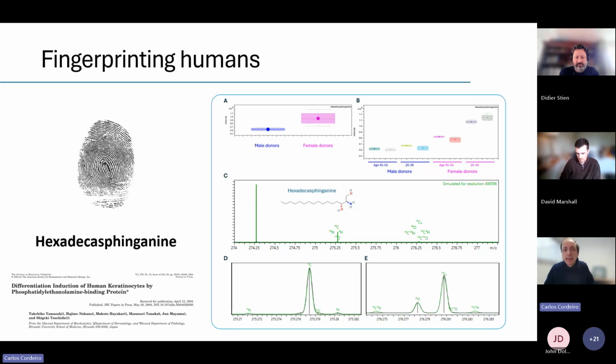And the main reason is because at this scale, we are dealing with lots of tens of thousands of signals, and it would not be feasible to actually do MSMS of all of this in a realistic time frame by direct infusion. So basically, an analysis for one of these spectra can take between 5 to 15 minutes, depending on the resolution we want to achieve. So it can be very, very high throughput.